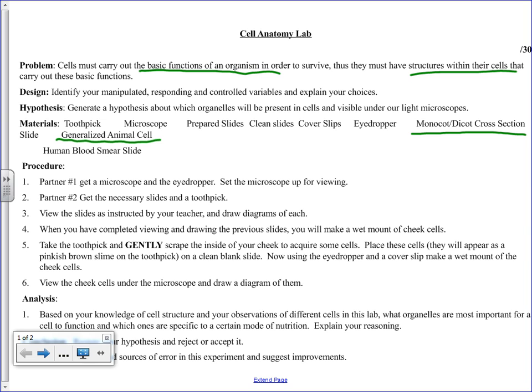And then you'll be able to start figuring out what some of the blotches inside of the cell are. This morning, in both classes, several groups had theirs focused well enough to see Golgi, mitochondria, ER, rough ER, nucleus and nucleolus, nuclear membranes. If you get them focused and are patient, you will see these structures quite clearly. For the most part, yes, but there is one that I want to talk about in just a minute.